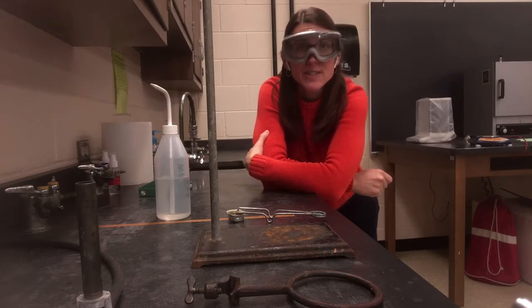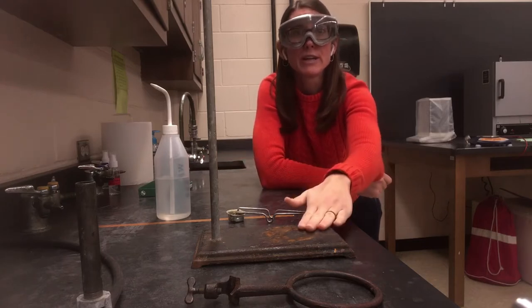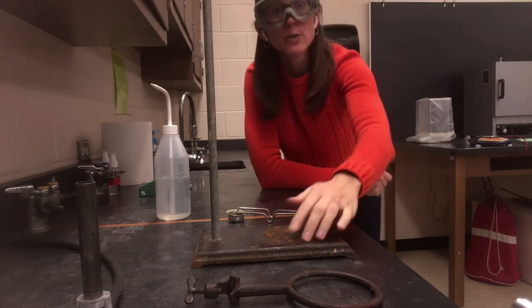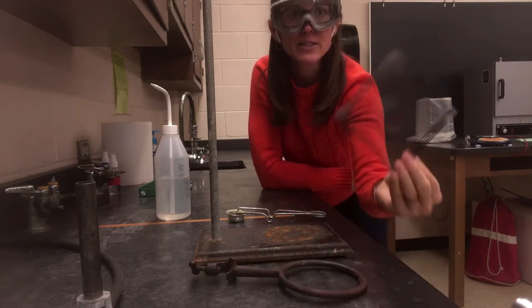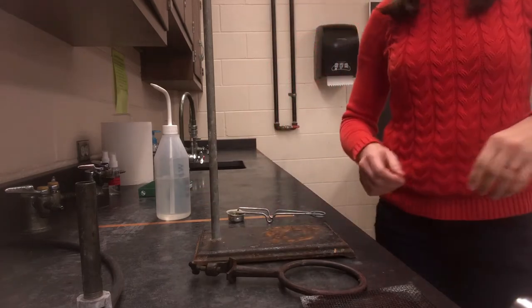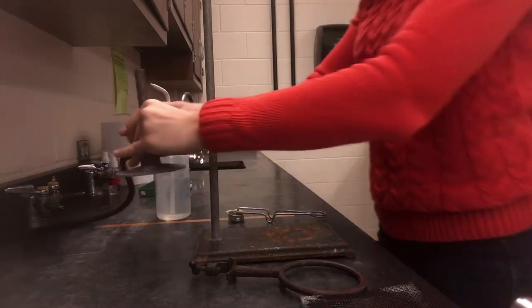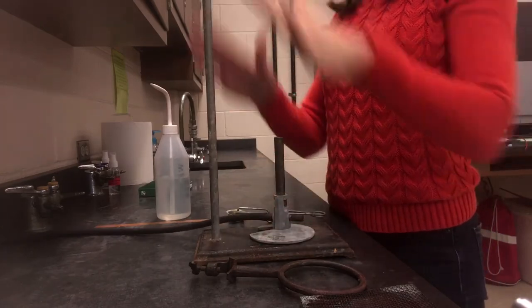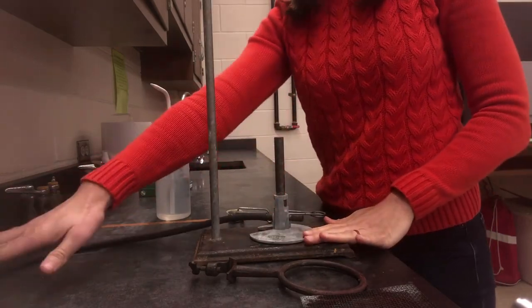The process for setting this up will require a ring stand (that's the big metal post), a metal ring, a piece of wire mesh, and then your Bunsen burner. So what you're going to do is take your Bunsen burner and place it on your ring stand. You want to make sure it's still going to be able to reach the gas jet.